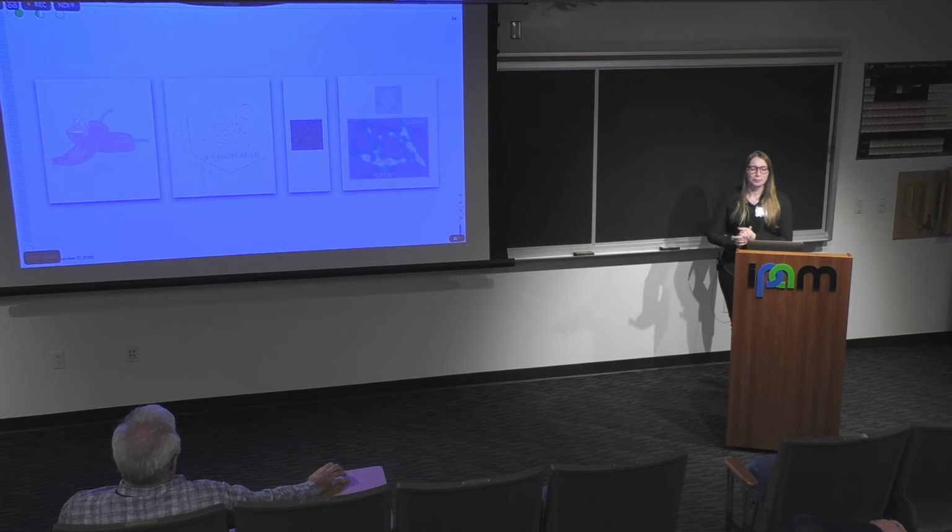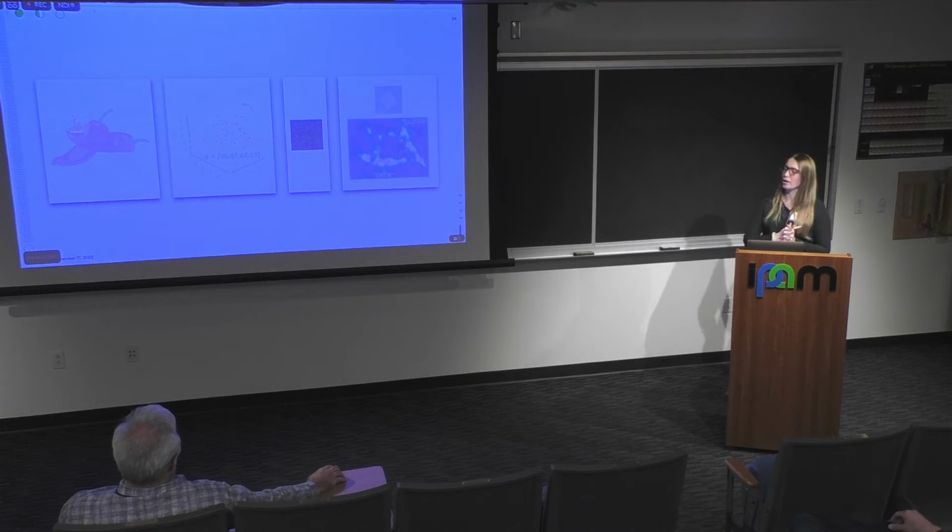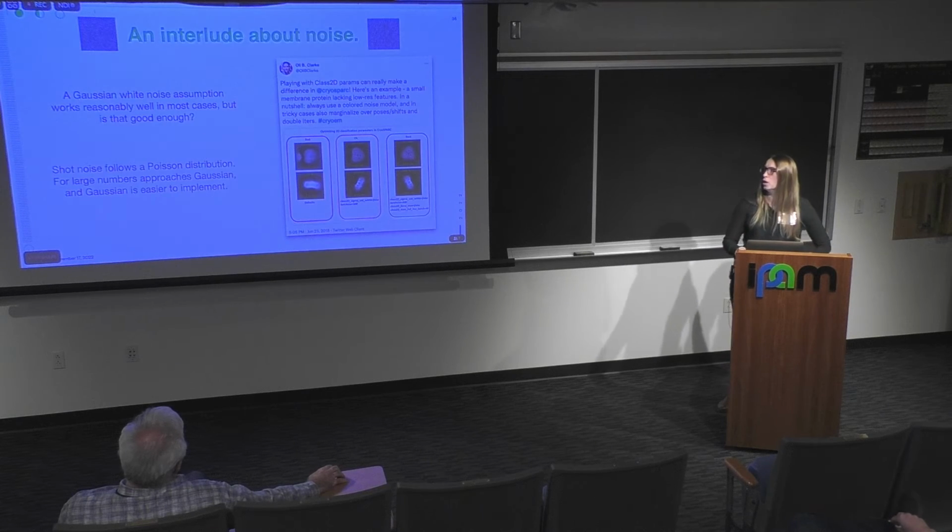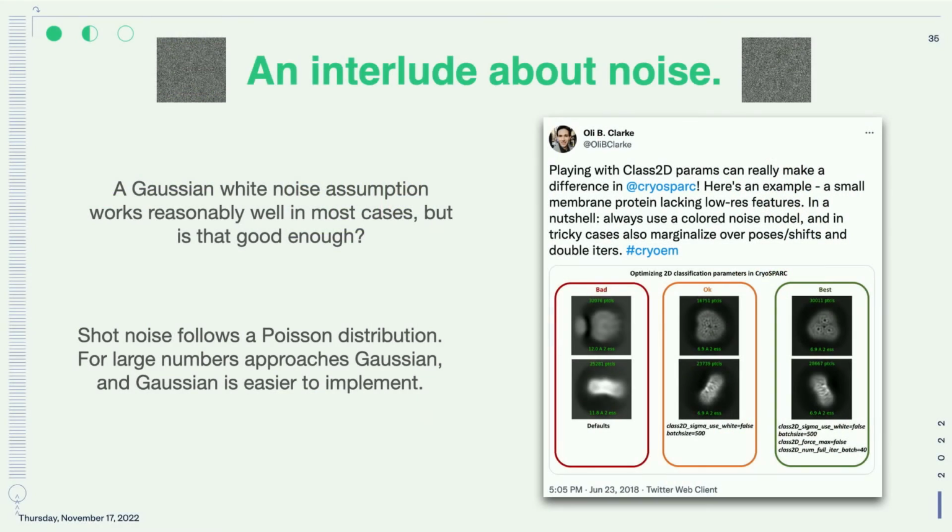All right, so after that, I have a bit more levity with thinking about some noise, and then I'll move on to thinking about heterogeneity in cryo-EM. One of the things that we've talked about a lot at this workshop is the problems we have around noise. It's tough to even confidently and reproducibly estimate your pose, for example.